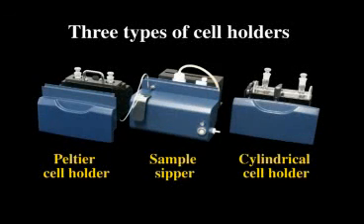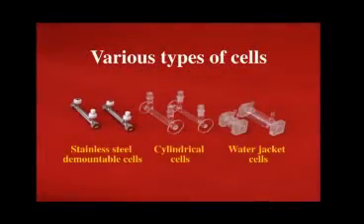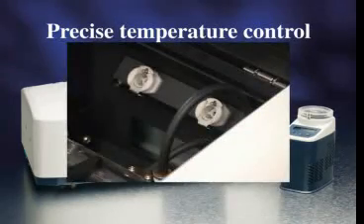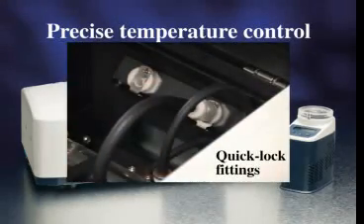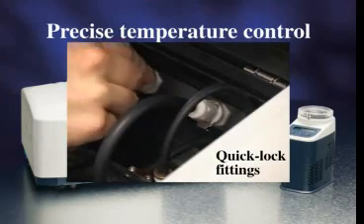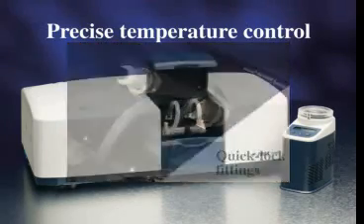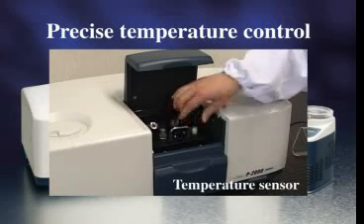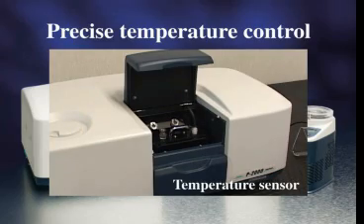The new P2000 offers three types of cell holders, and various types of cells are also available. Micro-cells are suitable for limited volume samples. The P2000 is supplied with tubing for water circulation temperature control. Quick-lock fittings enable an easy connection between water-jacketed cells and an external water bath.